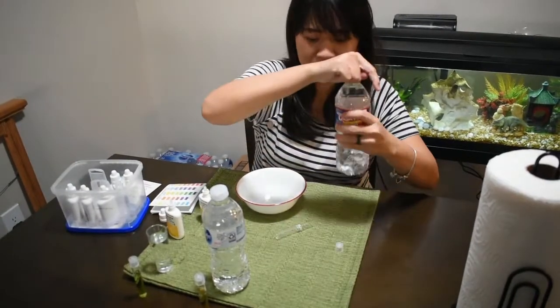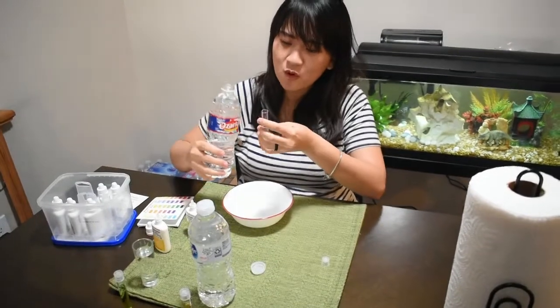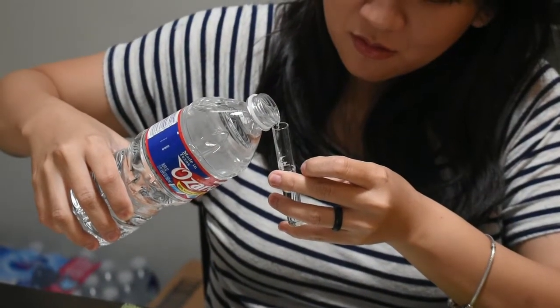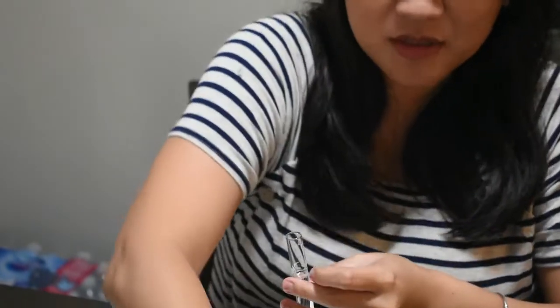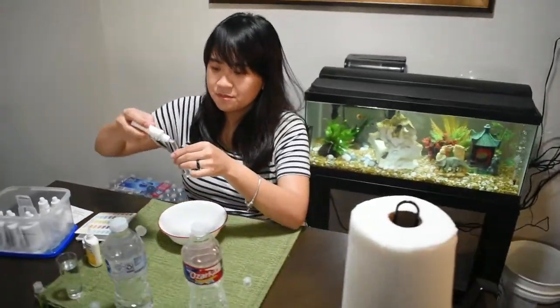And the last one, it's still sealed too. Spring water. Yep, that's it. 5 ml. Close this. Same like before.